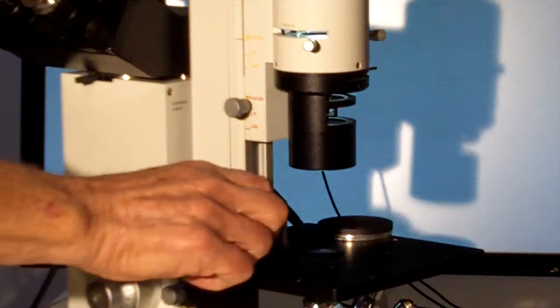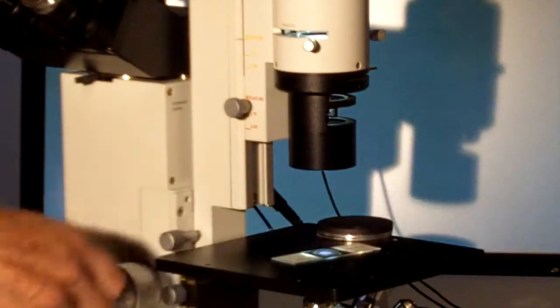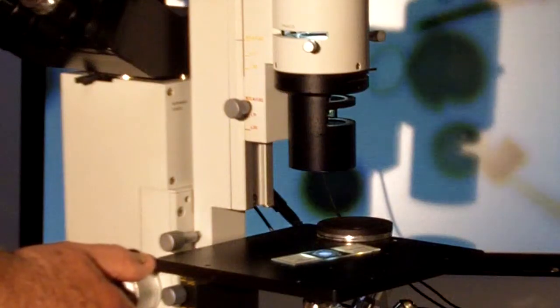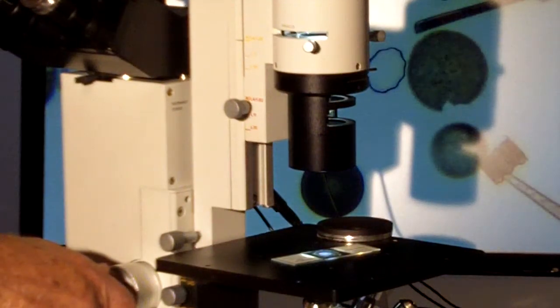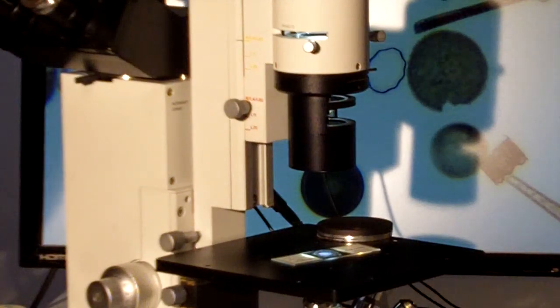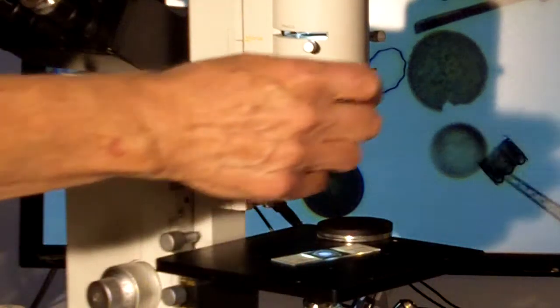The next slide I'm going to put on is a teaching slide also, a reference slide in brightfield. We're using a 10x objective. This is what's called a strew slide and that works pretty good in brightfield.